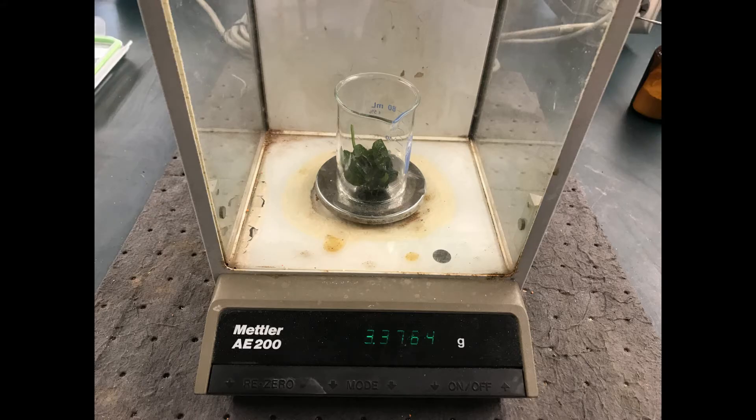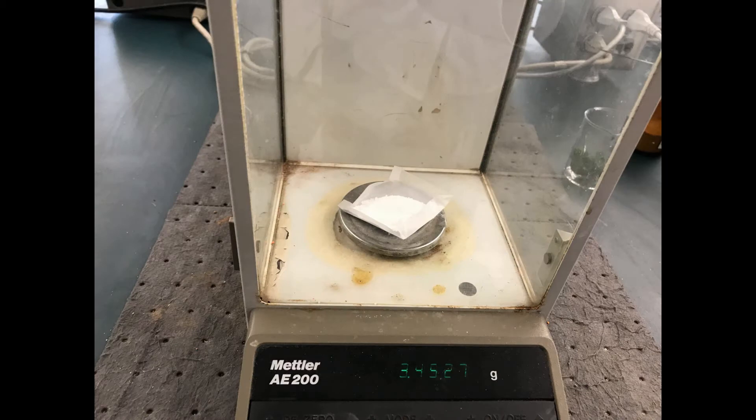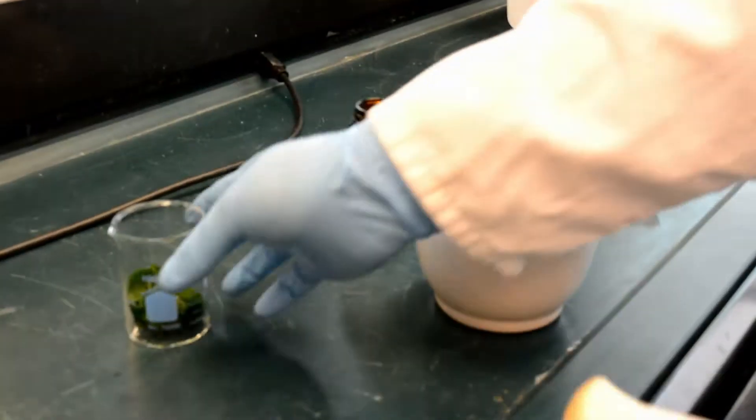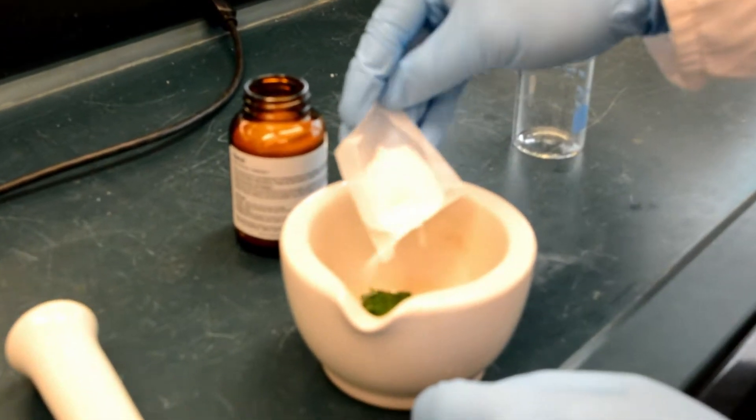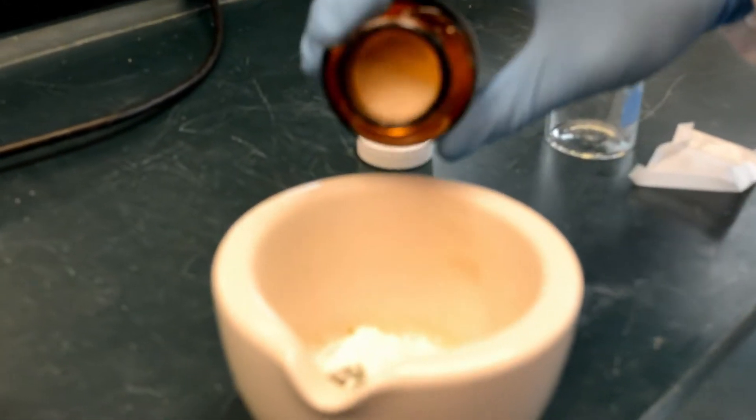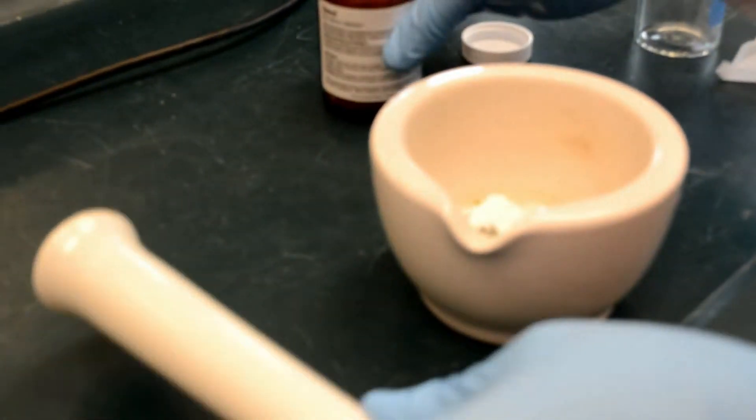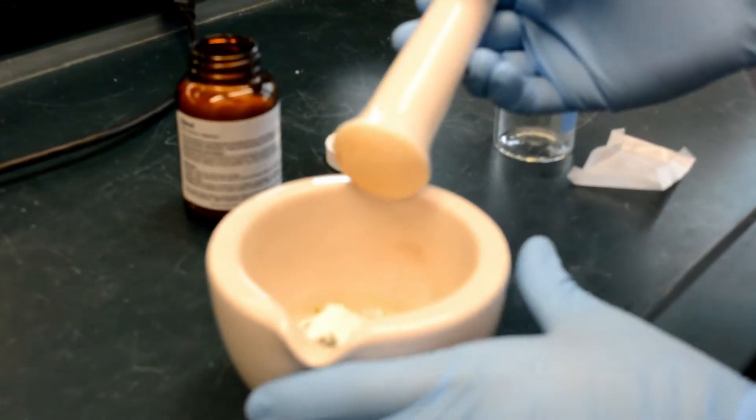Weigh about 3 grams of frozen spinach and 3 grams of magnesium sulfate. Add the spinach, magnesium sulfate, and a pinch of sand to the mortar and crush the mixture for about 5 minutes using the pestle.